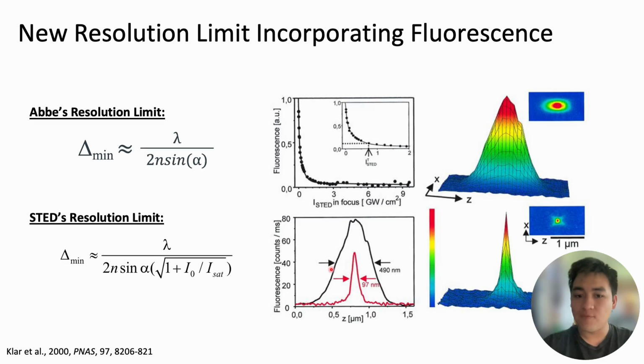And if we look at this graph here, we can see that this original non-STED based microscopy is so much larger than the 97 nanometer that we get. That gives us a much crisper, more defined pinpoint on where this fluorophore is. And so this is called a point spread function. It essentially tells you, oh, this is where we think that a fluorophore is. And having a much skinnier PSF compared to this PSF allows us to have better resolution, better clarity, better contrast, all that stuff we heard about in the beginning from Mark.